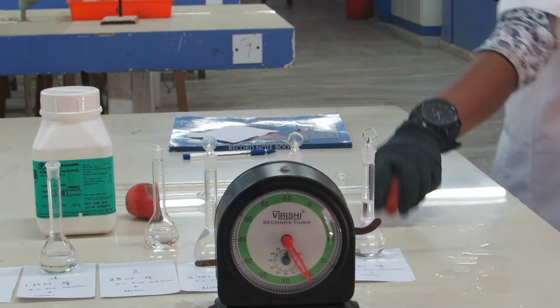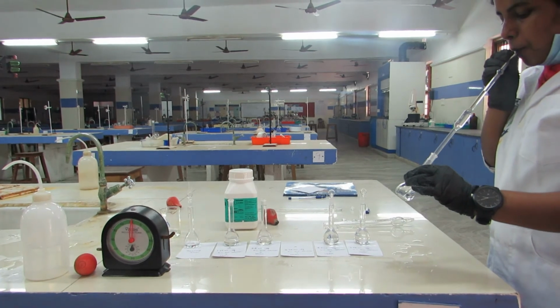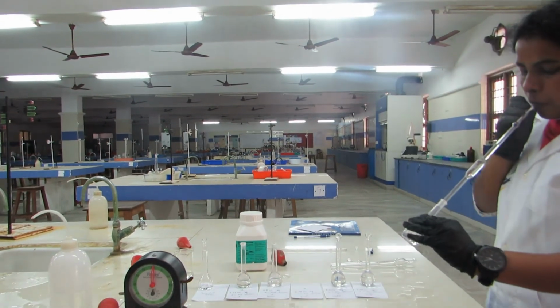Now for 0.75% polyvinyl alcohol, we have to take 10 ml with the 10 ml pipette, and we have to transfer the 0.75% PVA into the viscometer.